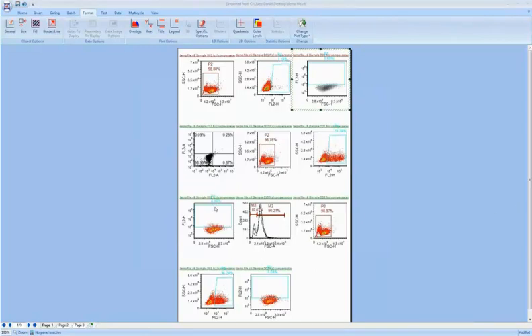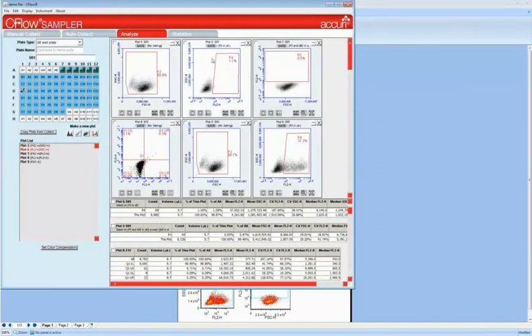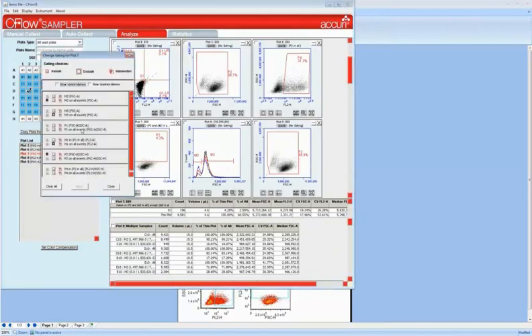So the other thing I wanted to show you very briefly is how the gating is applied. You can see that back in CFlow, all of the plots have different gates. The center top plot, for example, has a P2 in all gate, and we'll show you that in FCS Express. And if we look down on the left, we have a plot that has a very sophisticated gating strategy. Now CFlow lets you just include, exclude, or choose an intersection of whatever gates and markers and quadrants you have defined, and you tick things on and off.